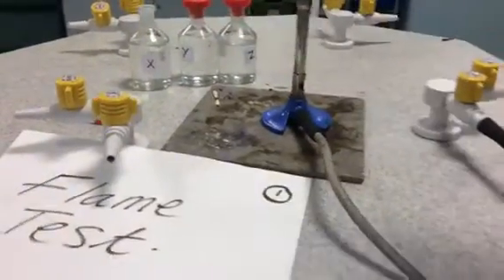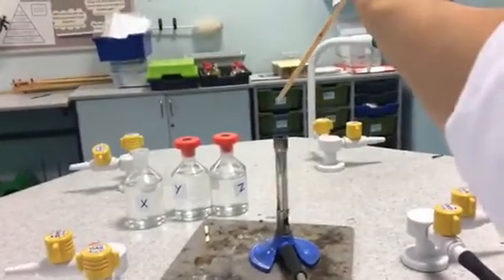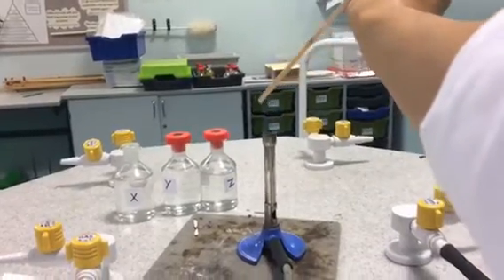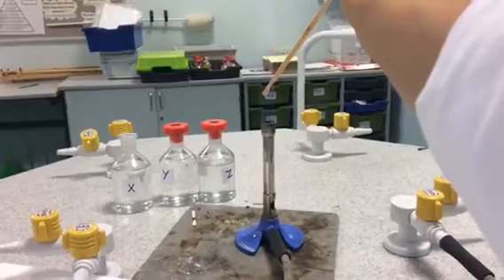Take a splint which has been soaked at one end in the unknown ionic compound. Hold the splint in a blue Bunsen burner flame and record your results in your table. The flame color can then be matched to the known metal ion.